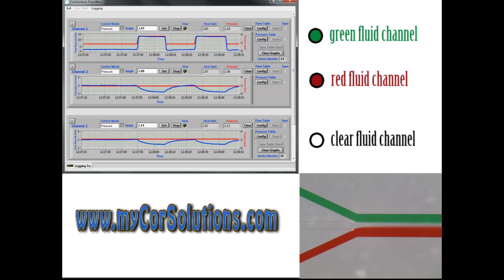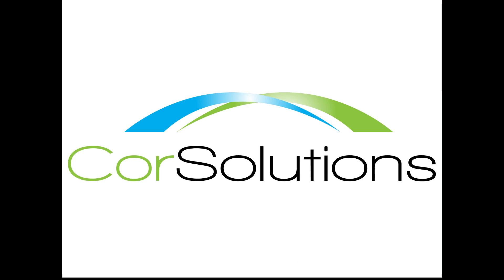This demonstrates the importance of operating in flow control mode with fast feedback, where flow or pressure changes in one channel do not negatively impact the flows in the other channels as observed here in pressure control mode.